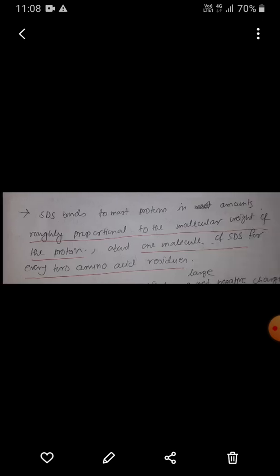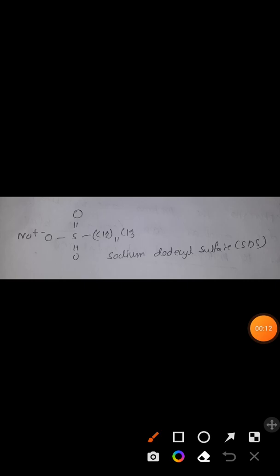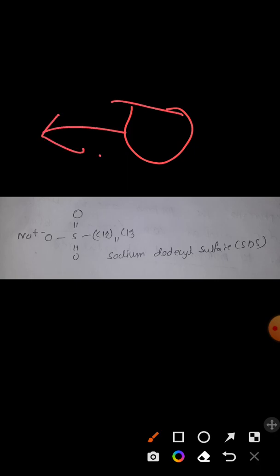Discuss the SDS-PAGE gel electrophoresis. In our previous videos we have discussed the basic principle of electrophoresis, that is, how the electrical force is involved in the migration of the molecule, and how the force called frictional force opposes it.